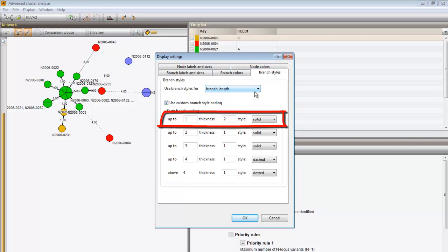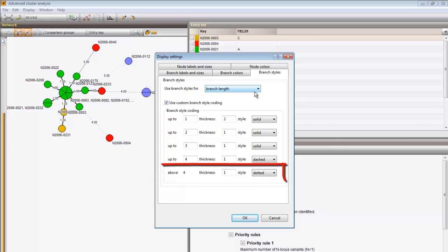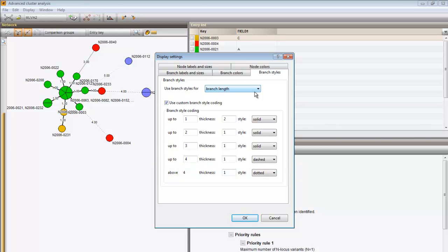You can also adjust the style of the branches according to the distance between the nodes. For example, a distance of 1 results in a solid line with thickness 2, while a distance higher than 4 results in a dashed line of thickness 1.